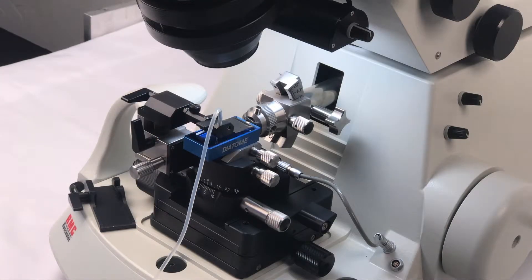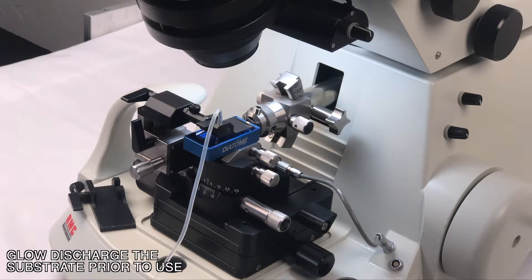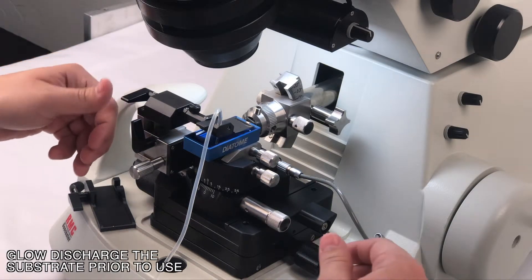This is the ash 2 operation video. Here we will demonstrate sectioning and collecting the ribbons. We will also demonstrate how to adjust the water level using the ash 2's tilt and vertical leverage. So let's get started.